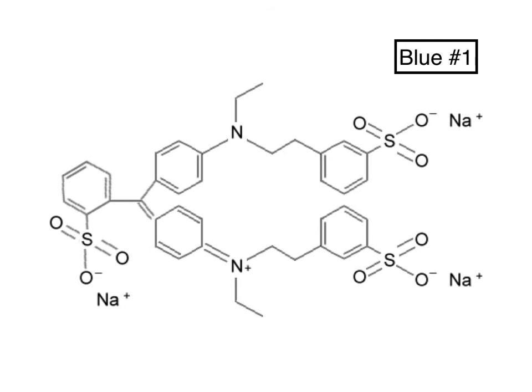So you put your dyes, your food colorings, onto the chromatography paper, the filter paper that we're using, and you set them down into these three solvents, and you watch the progression of the solvent up the paper, and you saw how it started to interact with the dots that you had made. And now if we look at the structures of the four dyes that are actually in most food colorings, you can kind of get an idea of what their polarity is.